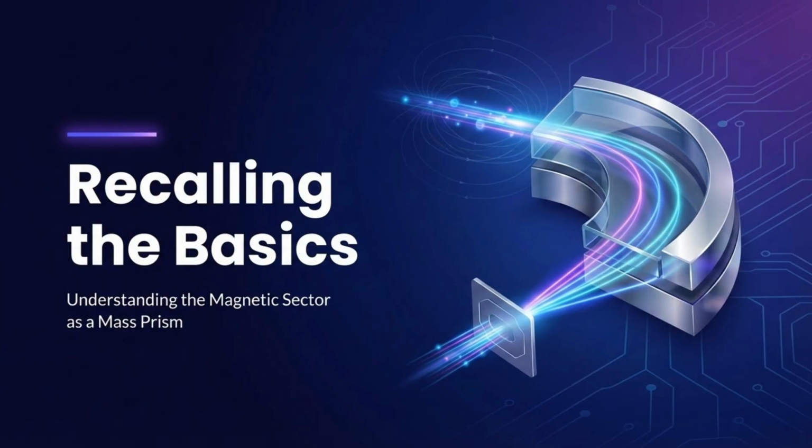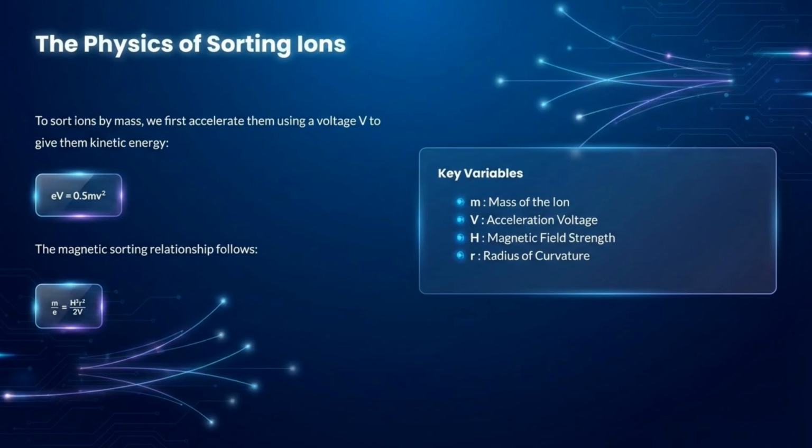Let's think back to Module 7-3. We talked about the magnetic sector as a mass prism. We learned that mass determines the curve, but there is a nightmare waiting for us: the velocity spread. Let's look at the physics involved. Think of it like this.